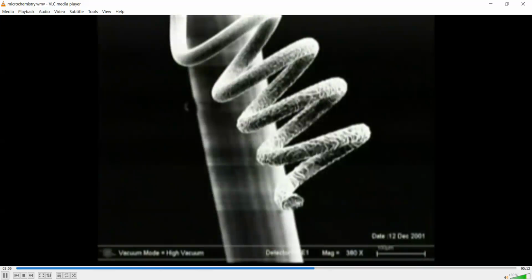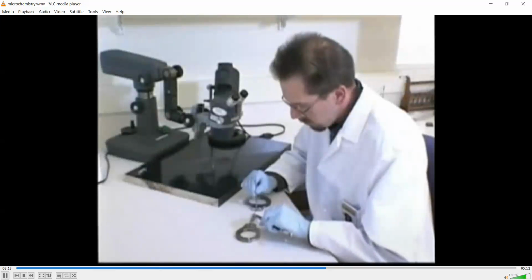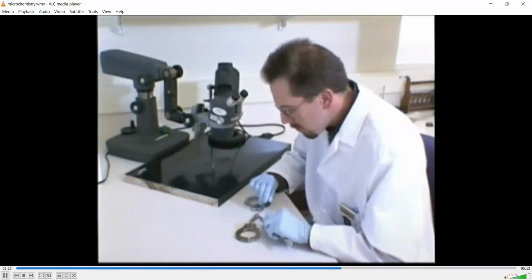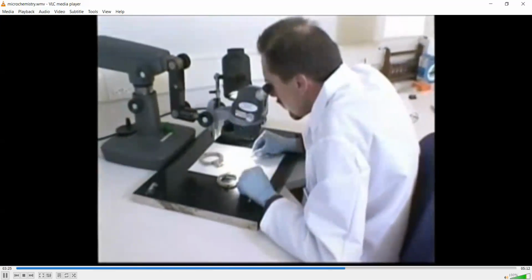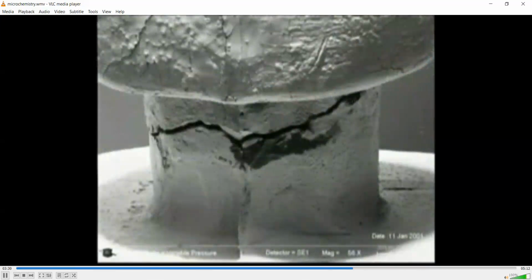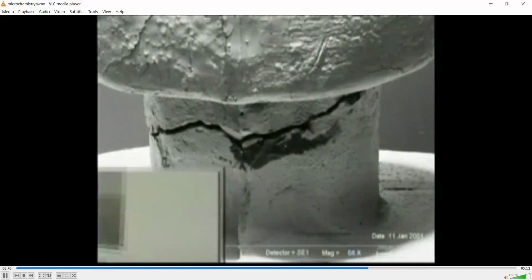Another function of the scanning electron microscope is its capability to produce high magnification, high resolution images. As an example, a handcuff was attached to a body of a homicide victim. A chain containing the fingerprint of a suspect was found at the crime location. Could it be demonstrated that the chain and the handcuff were part of the same manufactured unit? Using magnification revealed by the electron microscope showed a fracture match, indicating the chain and handcuff were once one piece.